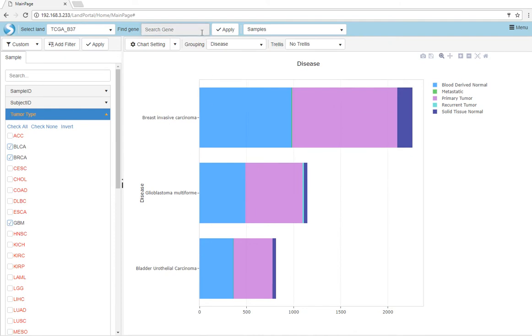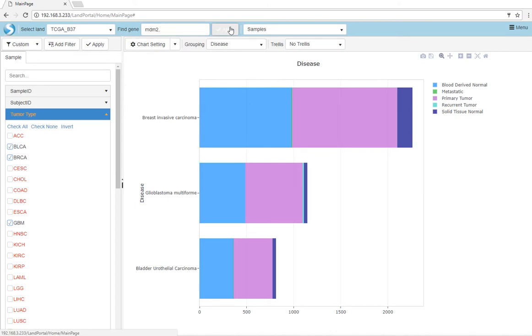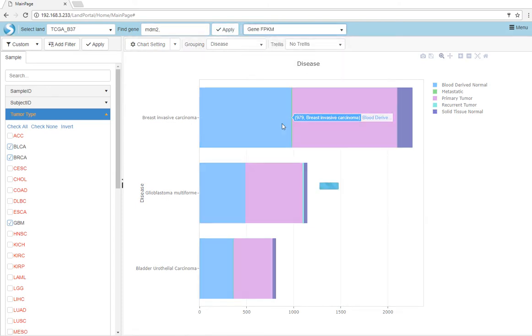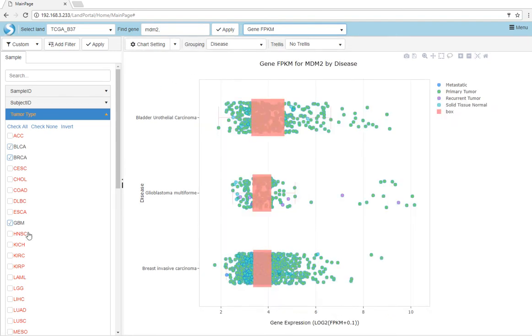We can also search for genes, such as MDM2, and query multiple gene level details, such as gene FPKM. As you see, our filter is still applied on the left.